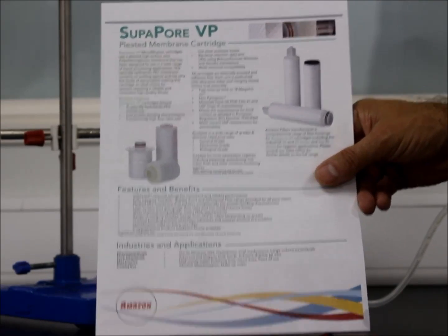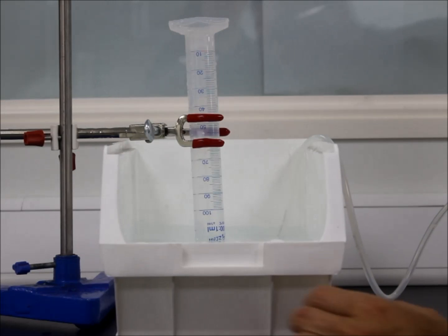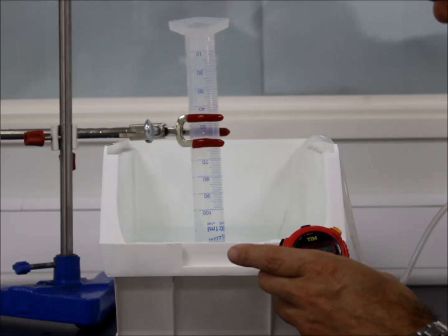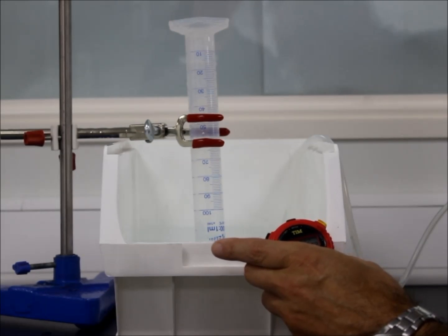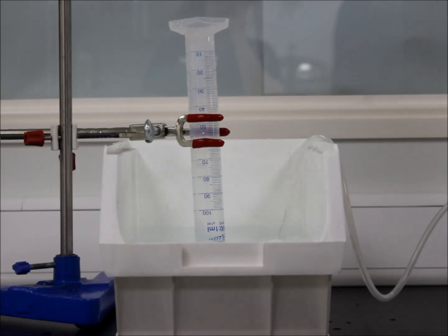We now need to measure the flow. If we go back to our data sheet, we can see the maximum flow for this filter is 30 mL per minute. So we insert our tube from the outlet of the housing inside this inverted measuring cylinder which is full of water, and we let it settle down for a minute, then we can measure the flow. We start the stopwatch and we can watch the air displace the water and therefore measure the flow. We come up to 30 seconds and we see at 30 seconds it's about 9 mLs, and therefore that equates to 18 mLs in a minute. Therefore this filter has passed the integrity test. This is a relatively simple way that you can carry out an integrity test and assure the customer that the filter is good.